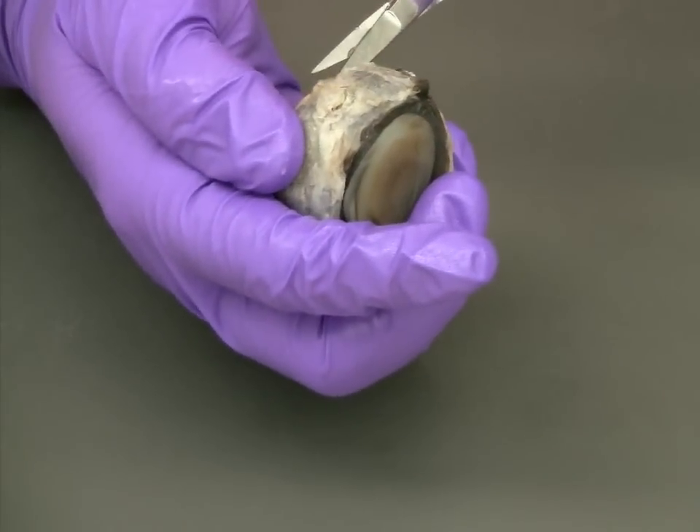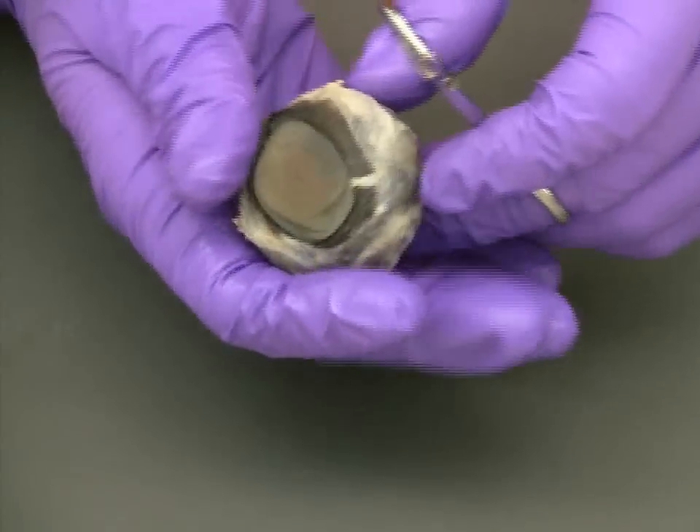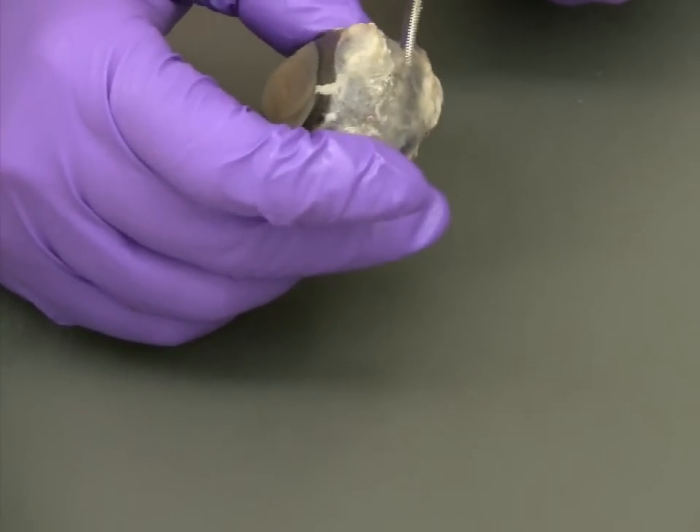As you move around the eye with the scissors and the incision gets larger, you will begin to expose the vitreous humor and a little bit of preservative fluid that may be remaining inside the eye.